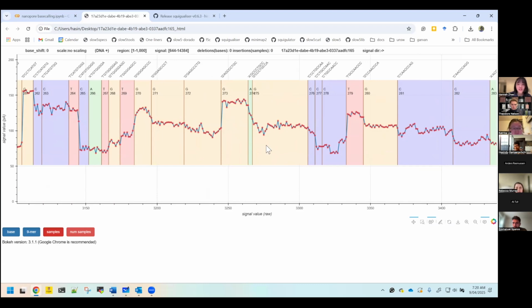I mean, the thing is the nanopore is not narrow enough to constrain one single base. At a time, there is a set of bases inside, which we call the k-mer. In R10 pores, it's about 9 bases that affect the instantaneous current. So it depends on the k-mer rather than the base, okay?